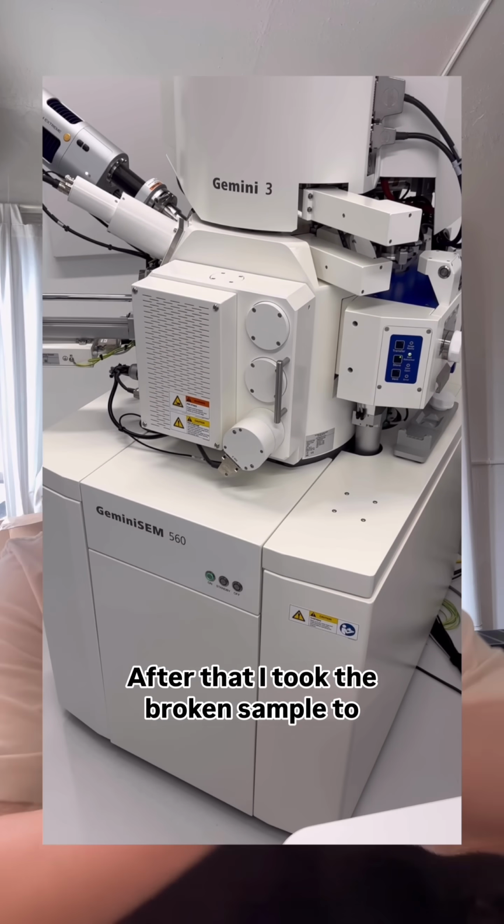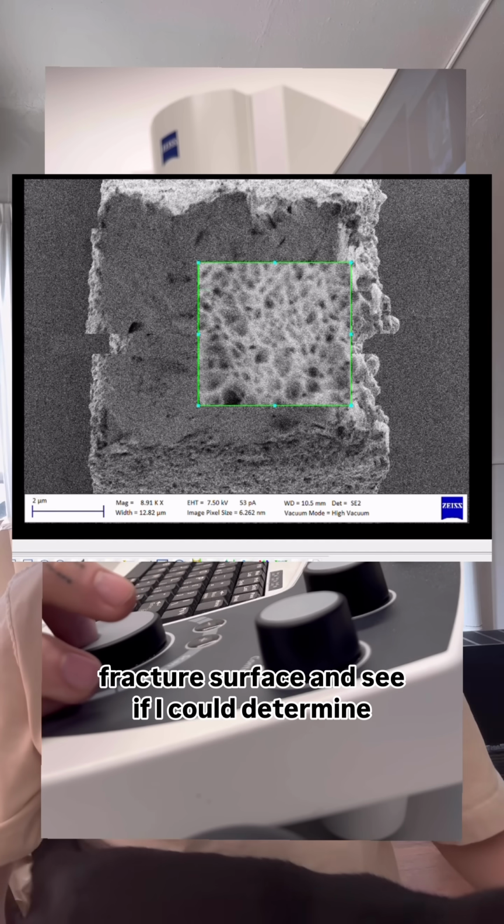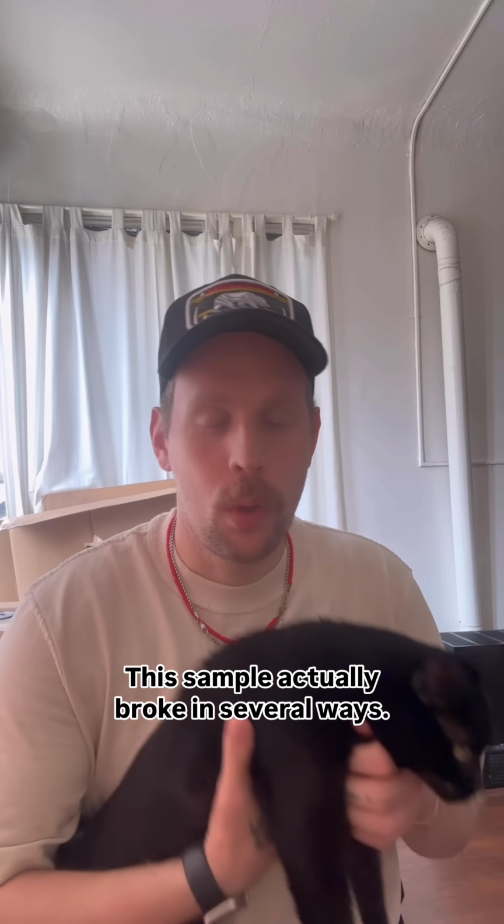After that, I took the broken sample to an electron microscope to look at its fracture surface and see if I could determine the exact cause of failure. This sample actually broke in several ways.